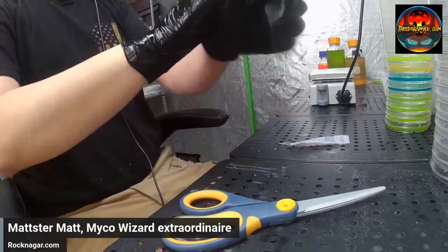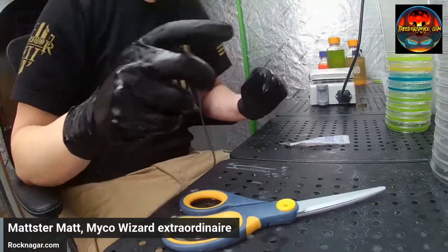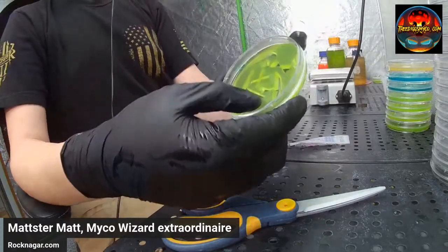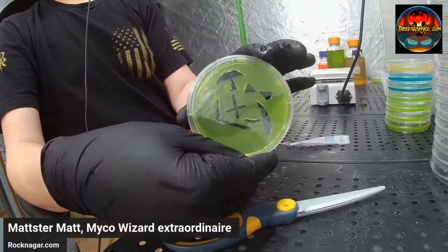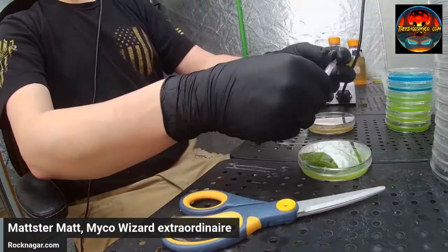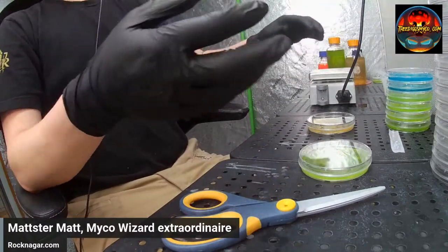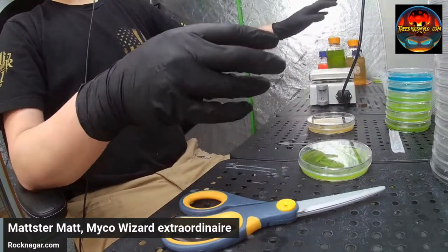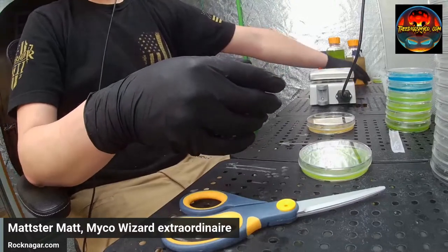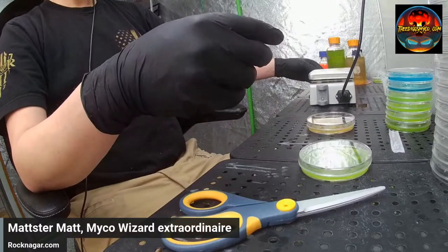All right, so now we got all our tools handy here. So like these ones, the ones that we're going to be using the syringes to fill, we can actually do when it's hot. It doesn't hurt to do because we're going to transfer it and it's going to cool in that process anyway. And we want to try and keep these things going warm while we're working. That's why we got it on this little heater pad. If you can't see it, this orange thing in the back. And then this is a heated stir plate to keep them going if I really need to.